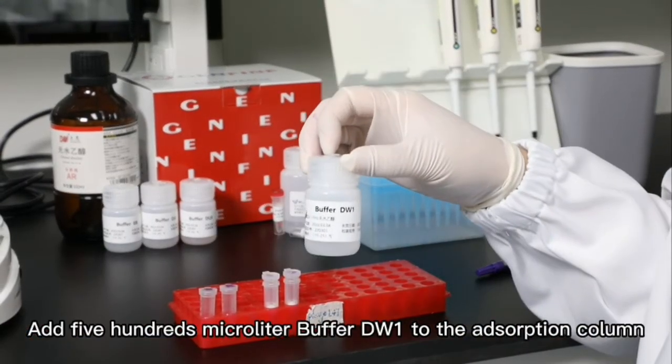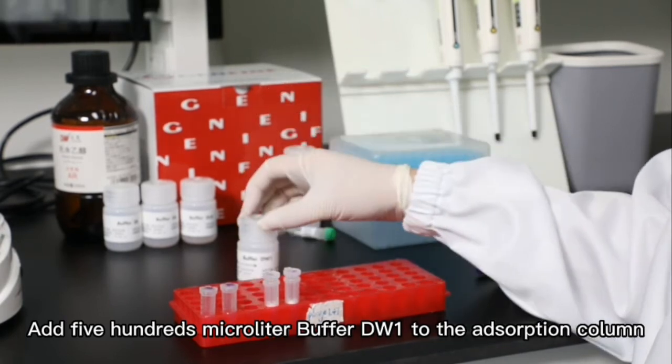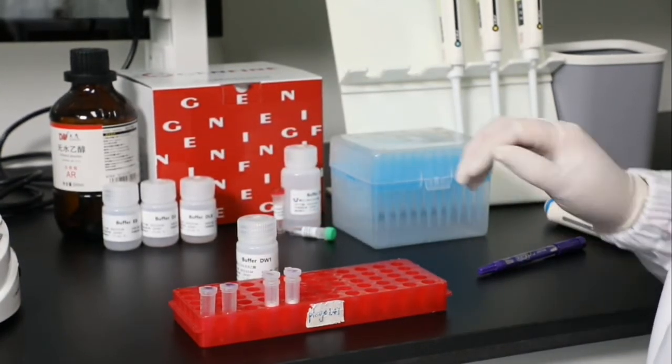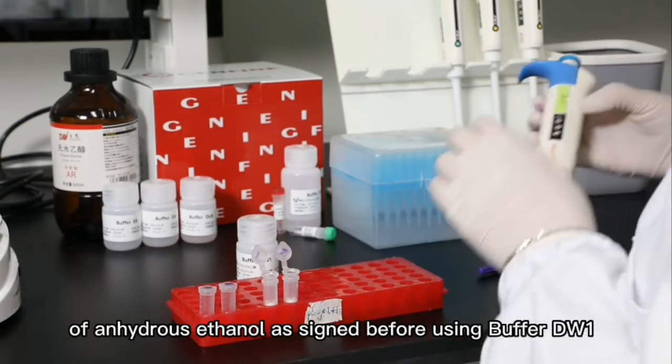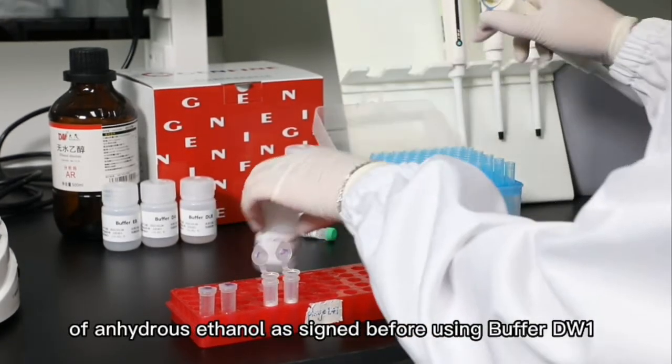Add 500 microliters of buffer DW1 to the adsorption column. Notice, please make sure to add the appropriate volume of anhydrous ethanol as assigned before using buffer DW1.